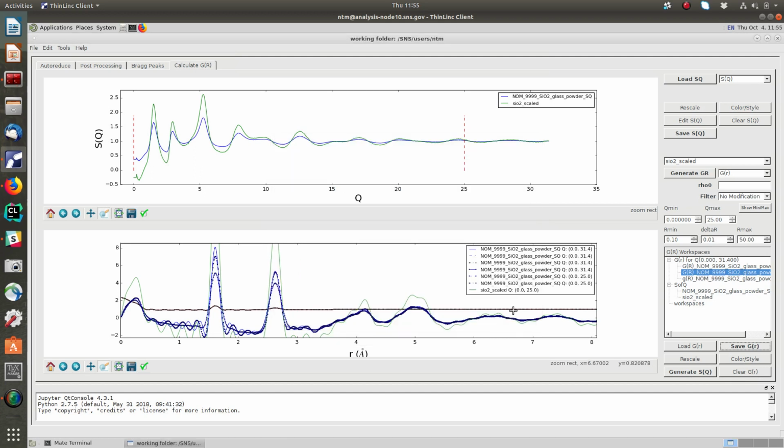And that concludes looking at and manipulating your total scattering patterns. Thank you very much.